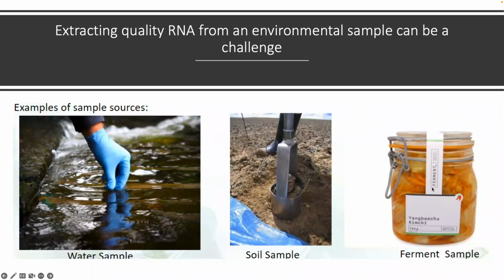Has it been pre-processed before? So I guess kimchi doesn't have that much processing in it, but human intervention in a sample, you should take into consideration the potential inputs that may have gone into it. So if we're dealing with food, could a food worker at a factory line have introduced a contaminant? You should be thinking about that as an, oh, well, this might not be a true representation of my sample. Ways to pre-filter or post-filter, depending on the reference genomes you might have. Also, just money in general. These types of extractions are costly.